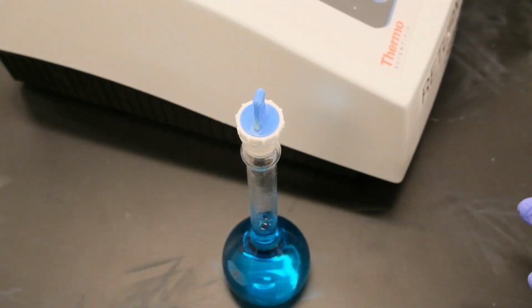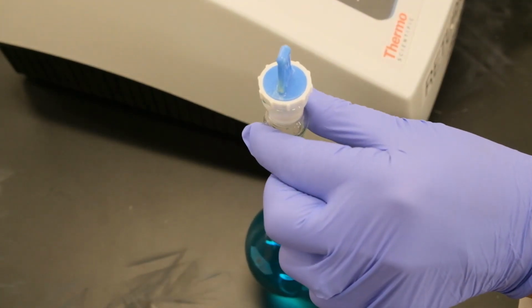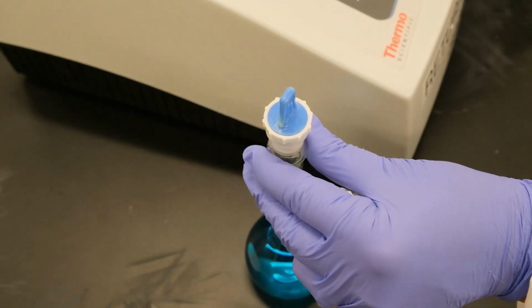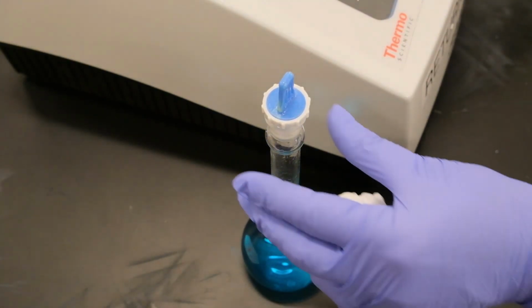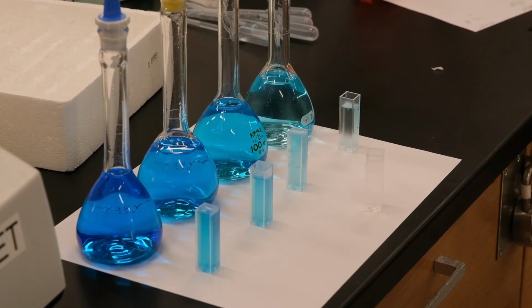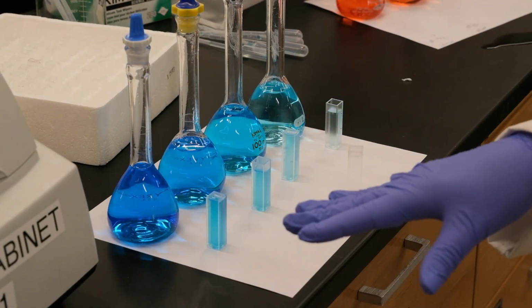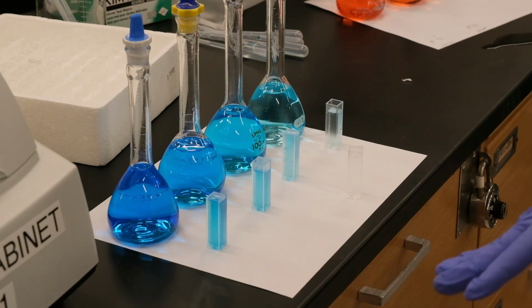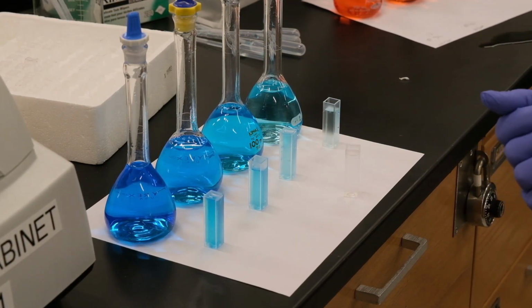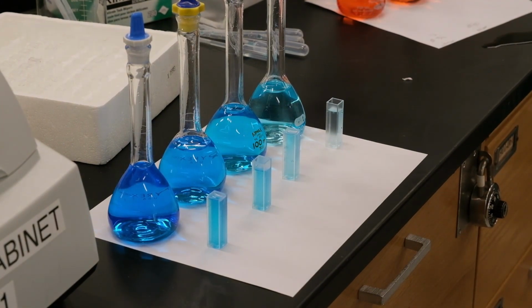Based on this absorbance, we calculate the concentration to go from 0 to 1 in absorbance, and we prepare 4 solutions, either diluting the solution of 3 milliliters or increasing the concentration of the solution from 3 milliliters to higher values. Once we figure out during the calculation what are the 4 solutions that we need to prepare for our calibration curve, we measure the absorbance of each solution. So we start from the blank.